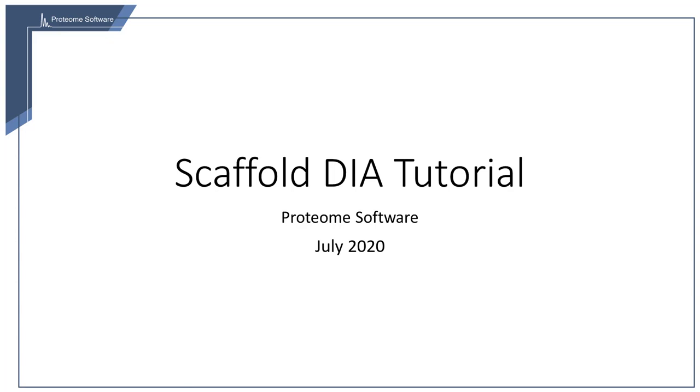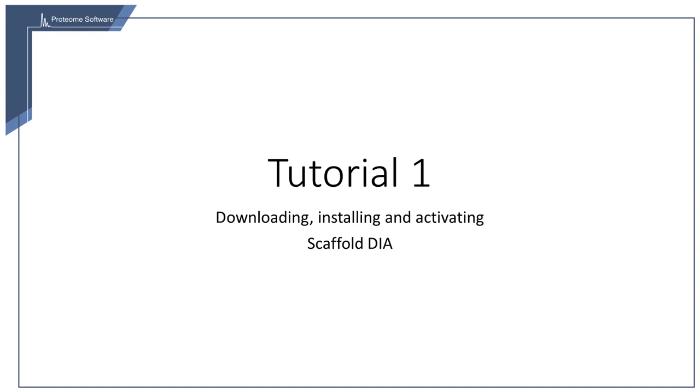Welcome to our Scaffold DIA video tutorial. Part 1 of the tutorial will cover introductory material including downloading and installing Scaffold DIA and activating the program using an evaluation key.